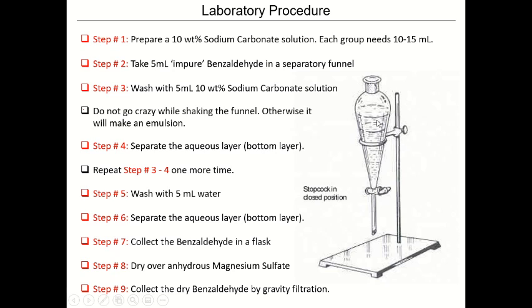Then we dry this organic phase over anhydrous magnesium sulfate, and then we have to collect the dry benzaldehyde by gravity filtration.